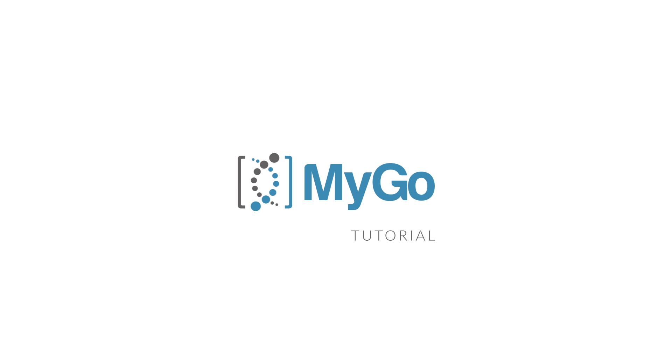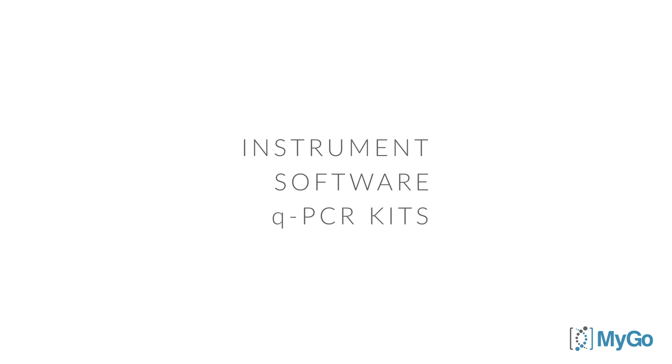Welcome to the first MYGO tutorial, where you'll learn about your MYGO instrument, software and QPCR kits.